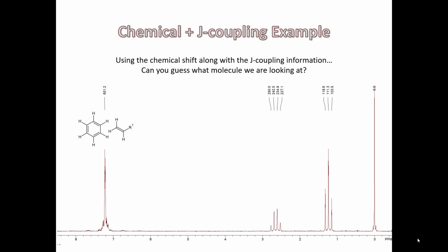So here we think we've got some type of benzene ring or double bonded. Down here we see we have a quartet, 4 peaks, and a triplet, 3 peaks. The quartet indicates that there's 3 adjacent protons. The triplet means there's 2 adjacent protons. We measure the coupling. They both measure 7.6 hertz, so we're pretty sure they're next to each other. And we can assume that this is an ethyl group. So we're making some progress as to determining how to interpret this spectrum.